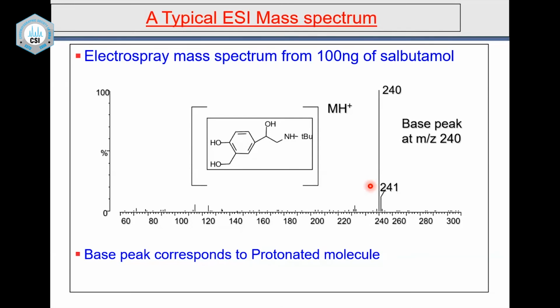But please remember that this is a soft ionization, so the M plus H plus does not have enough kinetic energy, and it will not fragment further down. So you will not see the other fragment ions, and that is in a way the beauty of LCMS also. First you can get the molecular ion. If you want to know the fragment ions, you can do a collision activation, which is an MS-MS. This will take me easily into an MS-MS lecture.